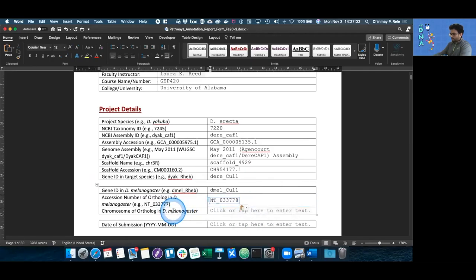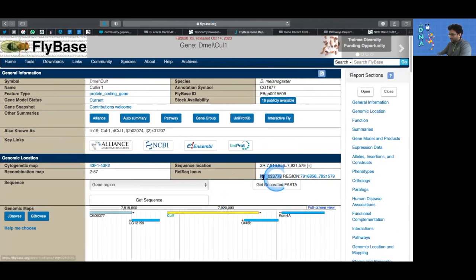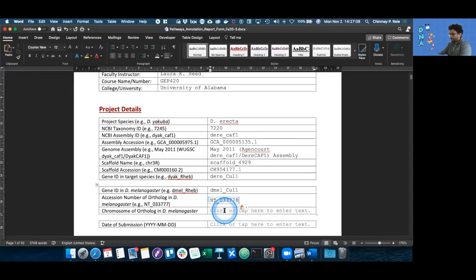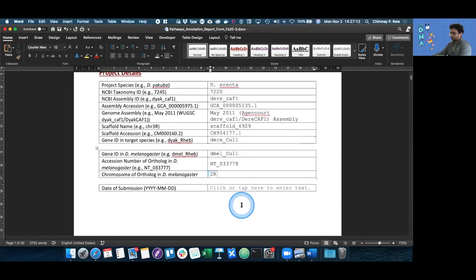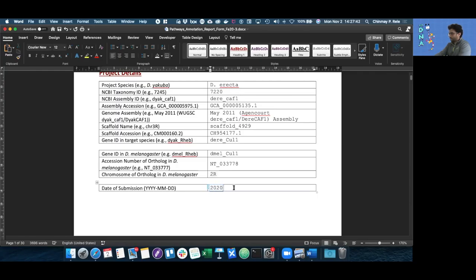The chromosome of the ortholog is going to be right above the NT. So in this case, it's the 2R, which we can either copy or just type in ourselves. It's also important to give us the date of the submission, which is important so that we can track when the model was submitted to get the student annotator to approve the document.